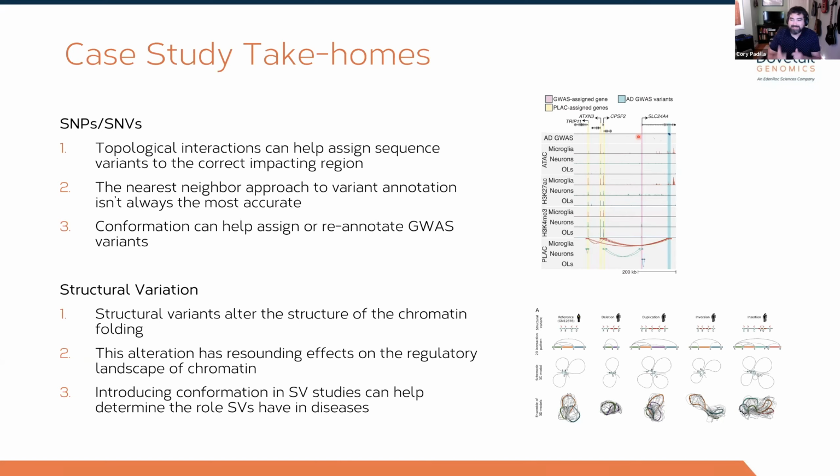It's all about getting to that mechanism of action rather than just detecting a phenotype, right? That's really the punchline here, is that Hi-C data, that interactome data type, really allows you to more fully and completely describe the mechanism of action that arises to the phenotype that's being observed in the RNA-seq data.